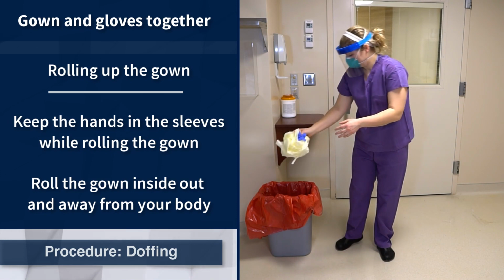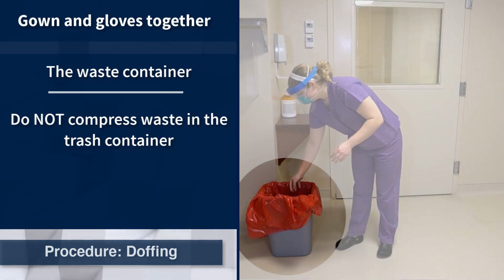Dispose of the gown and gloves into the trash. Do not compress waste in the trash container to make more room, as this can lead to aerosolization of contaminants, and if a sharp object was inadvertently placed in the trash, it could lead to injury.